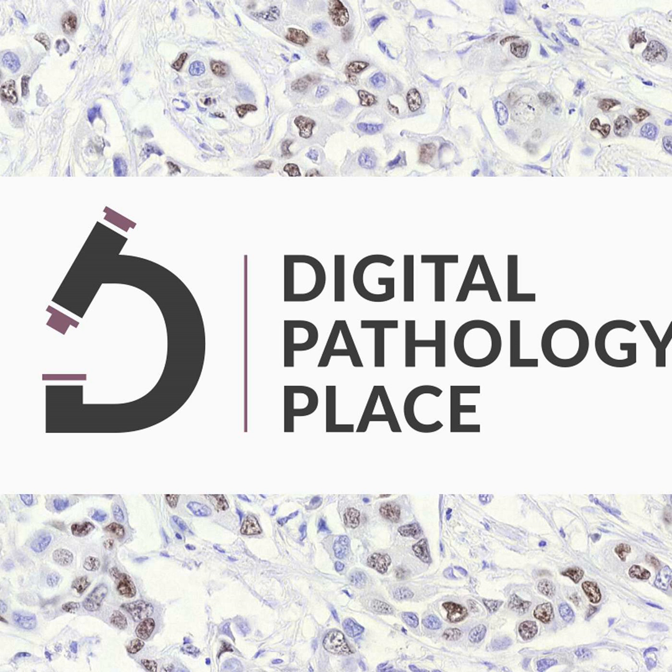You don't have this time in the clinic. And you mentioned this concept of clinical readiness of data, right? You don't have the time to tweak it. You can have a pre-written report that's going to be faster than a non-pre-written one, but still, you have to tweak it as little as possible.